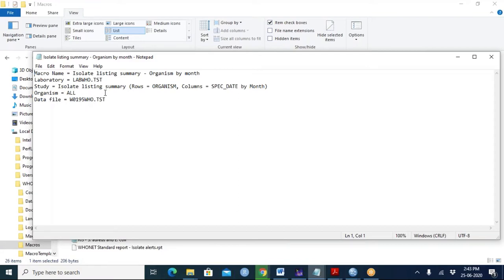You are actually telling us, I don't know how I can explain it for you. No, I already understand. Can you explain this one? I think your question is you want to understand the syntax, like what to type here? Yeah, exactly. Great. And the answer is you don't need to know. I'll tell you a little bit, but WHONET made this automatically. That's a good thing to do. I'll show you in a few minutes.